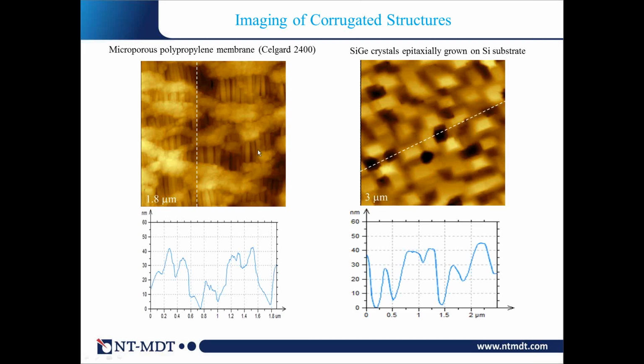and you can be fooled by that situation, because in order to profile that, even on the corrugation of 40 nanometers, you should have a properly adjusted scan rate, feedback, and amplification in order to get truthful information. You should always watch trace and retrace contours to see that you are really doing it very gently and not disturbing the structure. Of course, zooming out after imaging some local region also helps to verify you are not destroying the structure. Also, we recently looked at a very small object with the same, let's say, 40 nanometer corrugation.